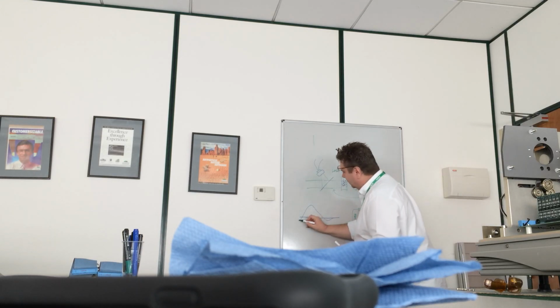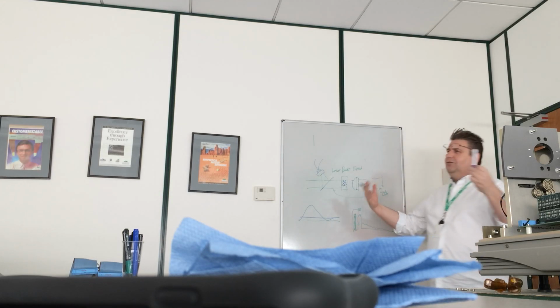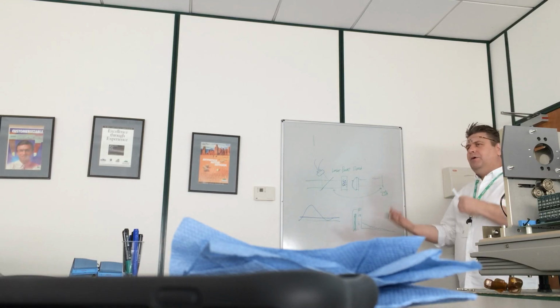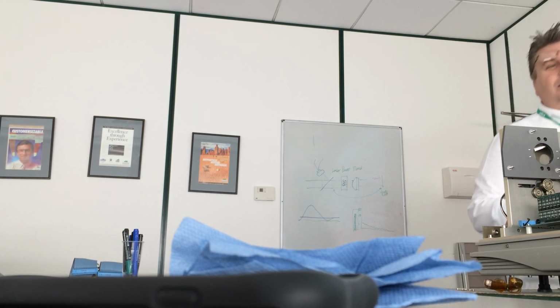So your real background is actually down here somewhere. Yeah. Suddenly, you get a lot more signal, you get a lot more particle size information. So that's what extinction really means.